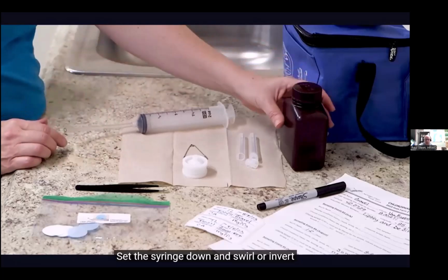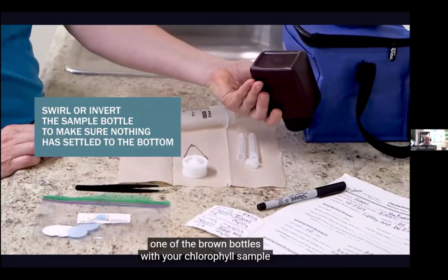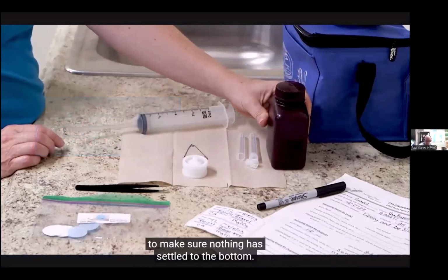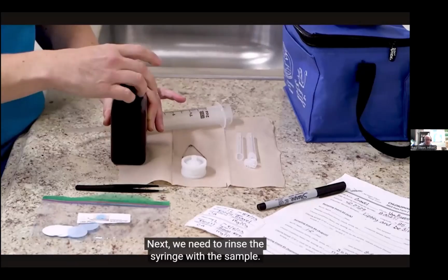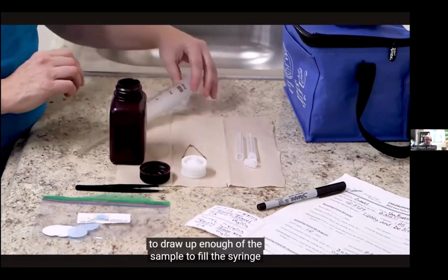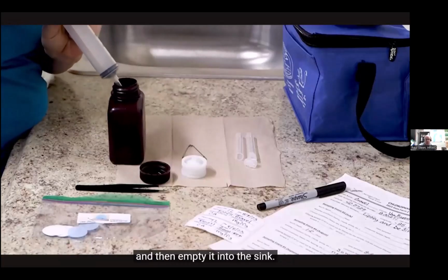Set the syringe down and swirl or invert one of the brown bottles with your chlorophyll sample to make sure nothing has settled to the bottom. Next, we need to rinse the syringe with the sample. To do this, use the syringe and tube to draw up enough of the sample to fill the syringe and then empty it into the sink.